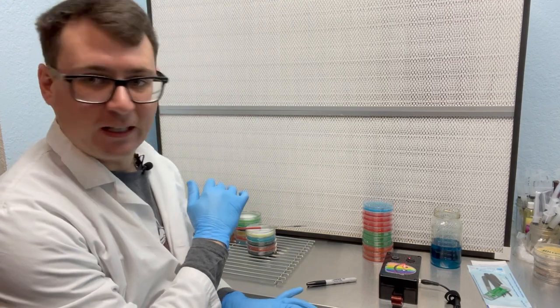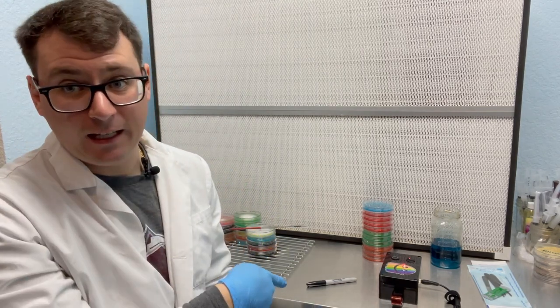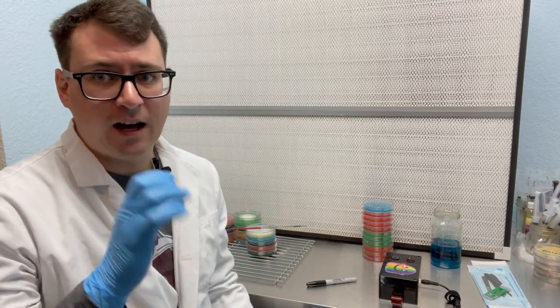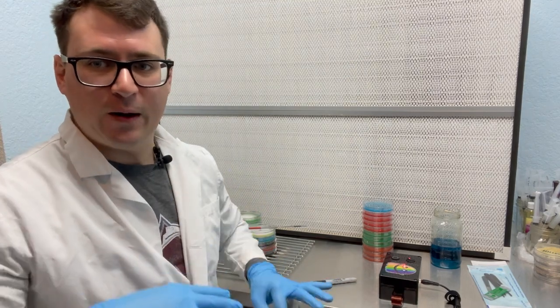Okay guys, I'm going to label these plates up, parafilm them, and put them in the incubator at 72 degrees for about 4 or 5 days. I'll keep a close eye on them to look for any crossover of the different mycelium types. But overall, that went really smooth.